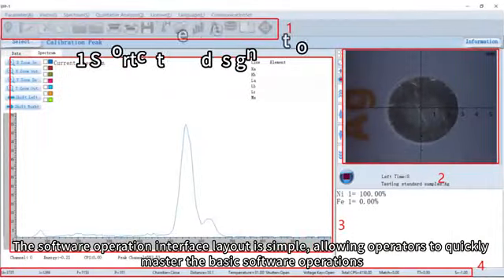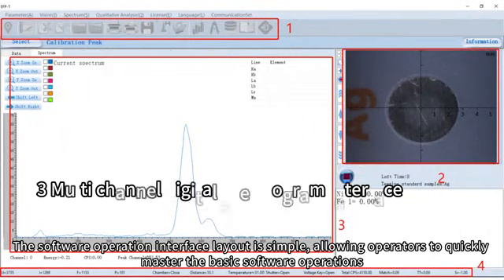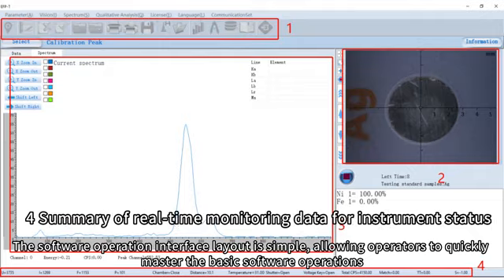The software operation interface layout is simple, allowing operators to quickly master the basic software operations.